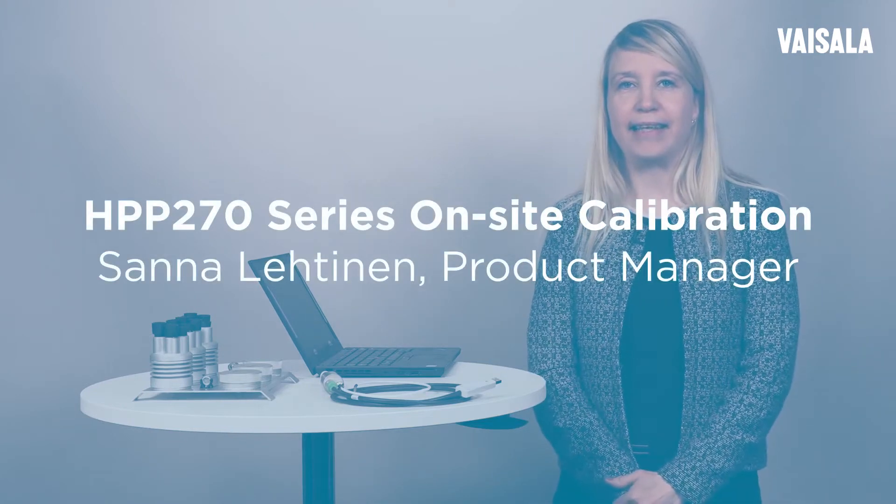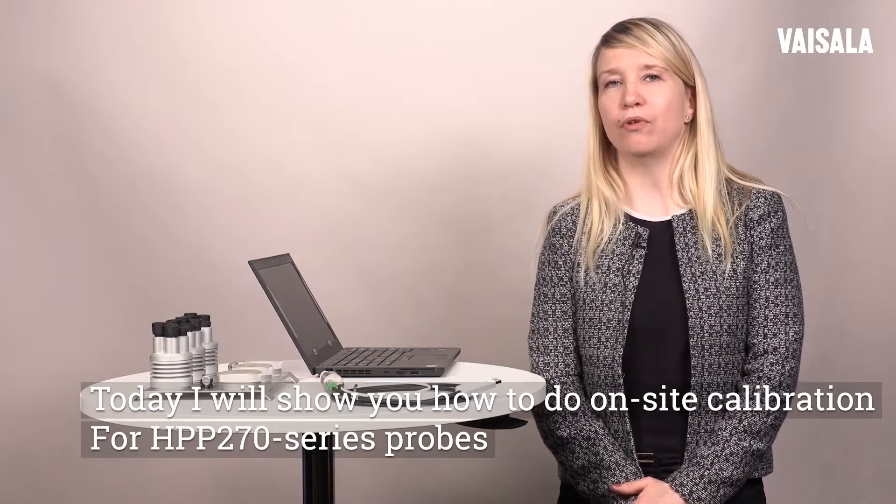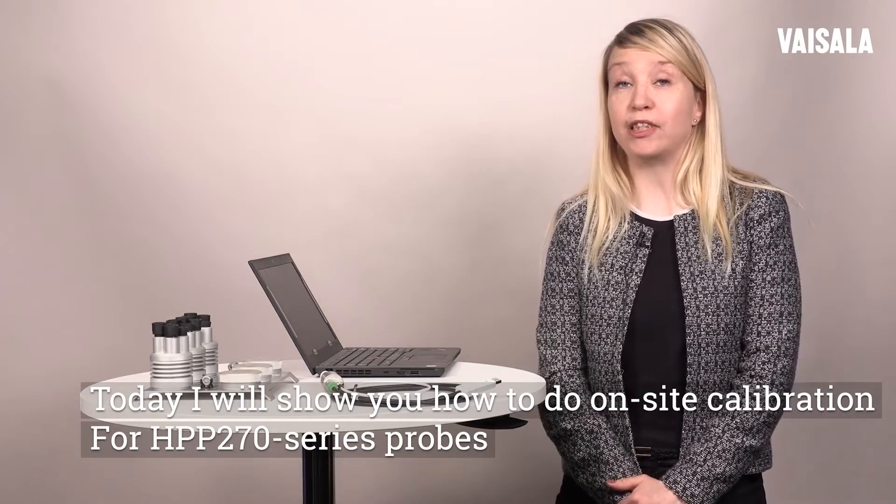Hello, my name is Sanna Lehtinen and I work as a product manager here at Vaisala. Today I will show you how to do on-site calibration for HPP-270 series probes.